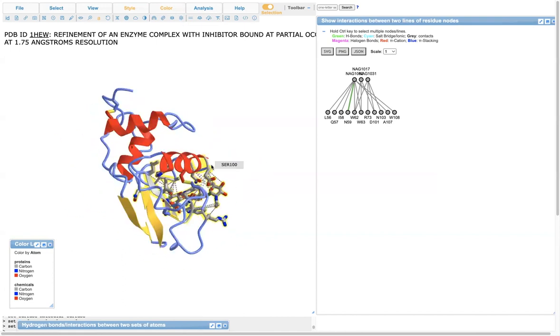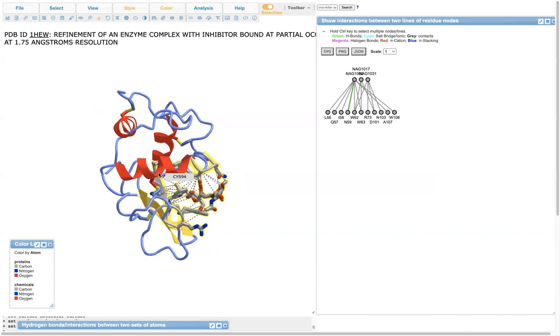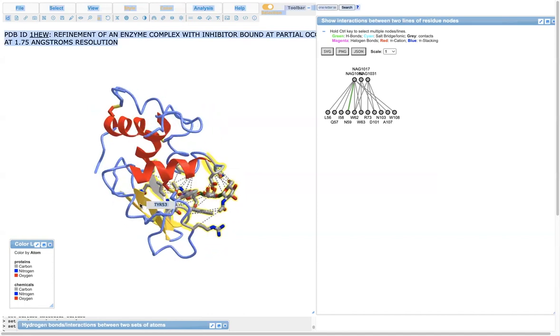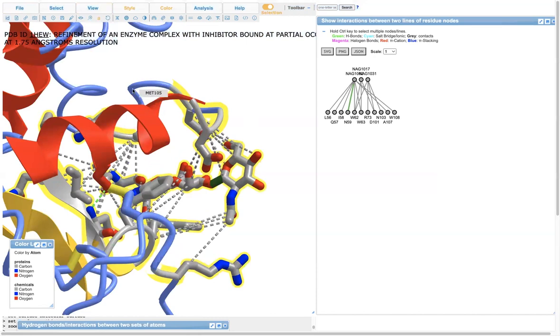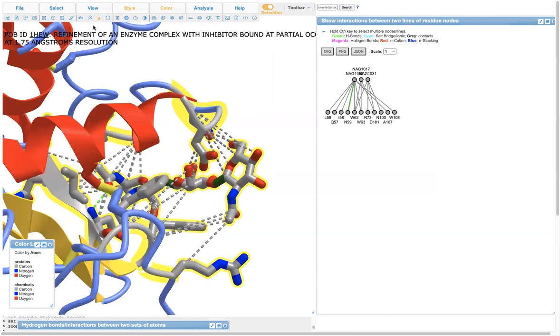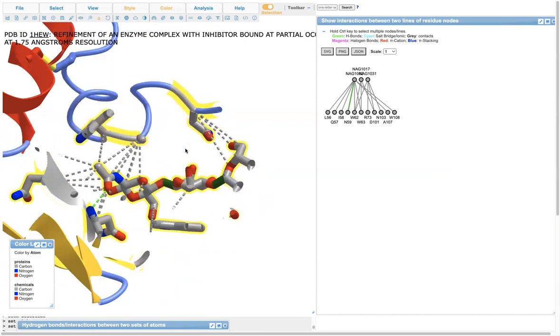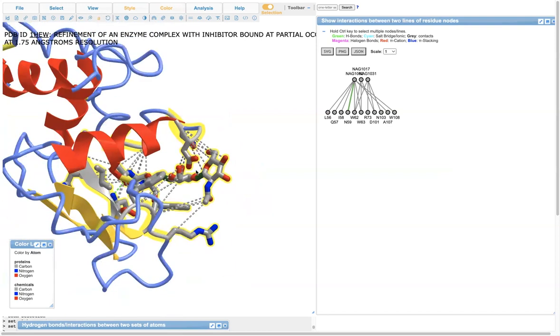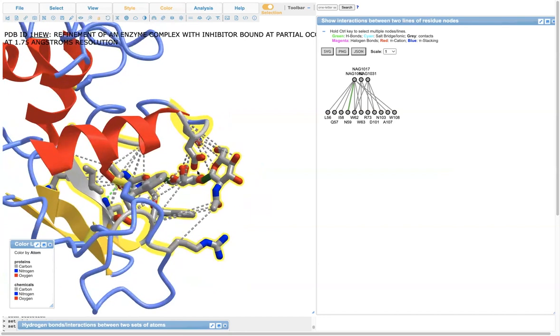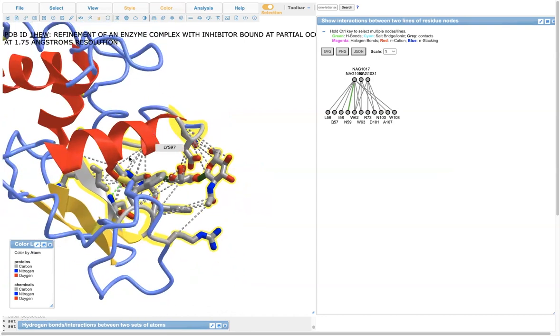1 finger with your thumb to scroll around, and pinch to zoom in and out. There are also commands you could do with a mouse. If you want to focus on a selection, there are ways to do this. So under View, you can zoom in on a selection, or various other options. You can also do a slab for a selection, where it'll let you just look at layers if you pinch in and out, or various different things. So you just have to play around.